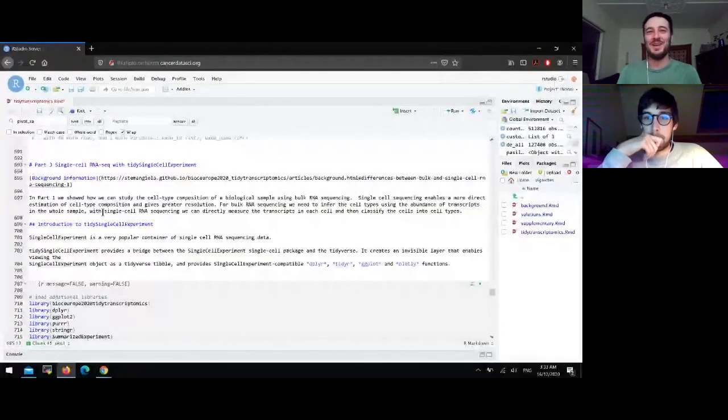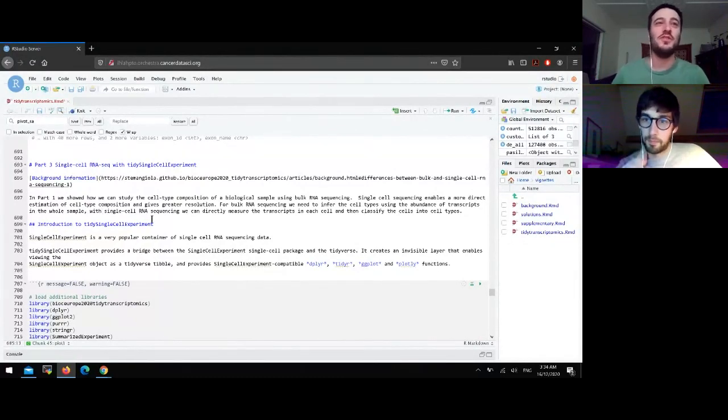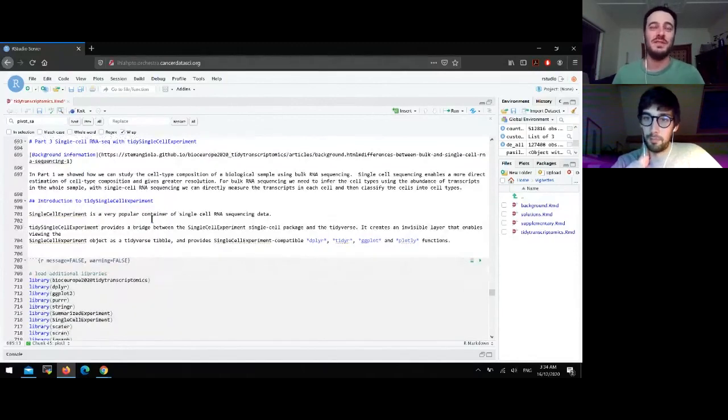We have a bit of material to go through, but I will show you quite a few things, mainly just to give you the possibility, if you are interested, to research further into the matter, as we have a lot of material. Okay, so let's start the single cell part. Not so much, I will not introduce any workflow. The workflow we will use here is from Bioconductor, so whatever you are used to using.